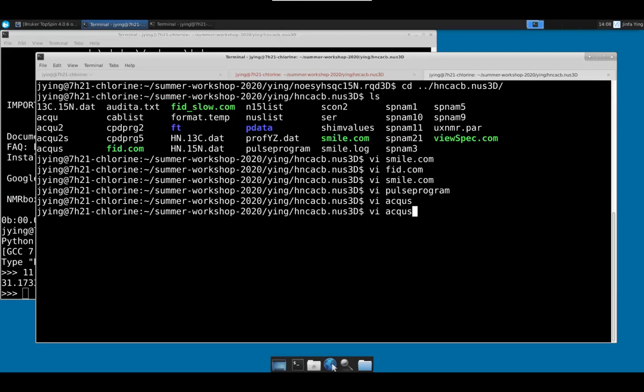Oh, and Frank calls this NUS ZF. It's NUS zero filling. It's really not zero filling. Oh, I see. So we don't have to worry about that when determining the new maximum FID size? Right. Okay. Thank you.